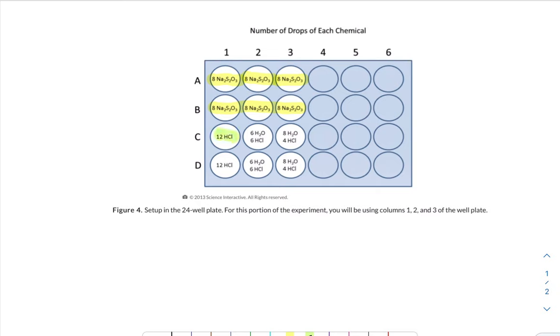You'll notice that you're adding distilled water, deionized distilled water, in some of the spots so that the total drops in all of your HCl spots equals 12. That's important for our calculations just to make them easier.